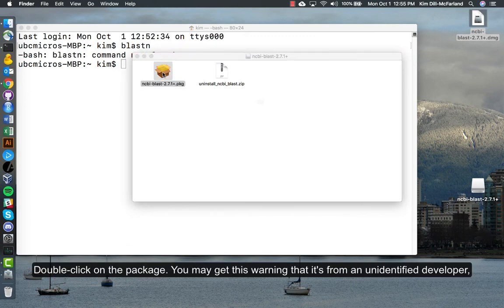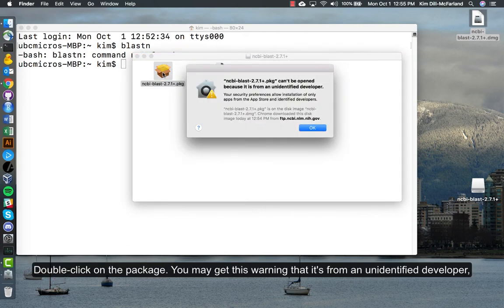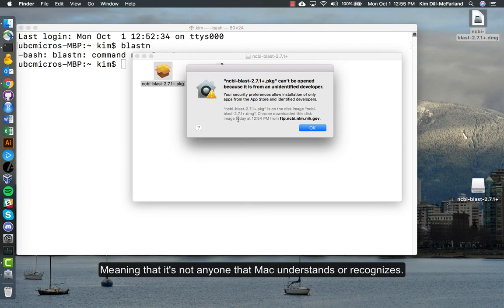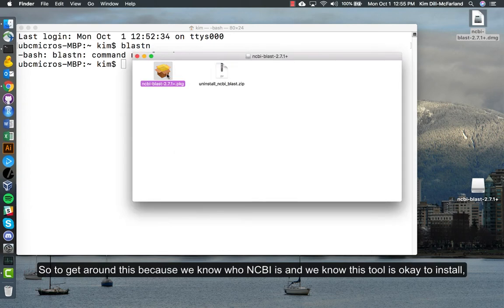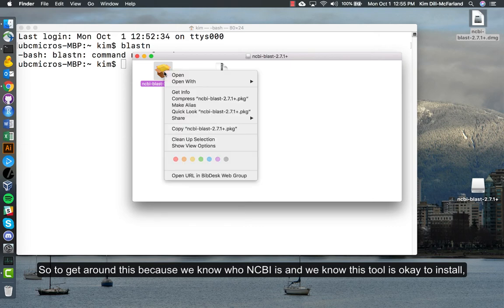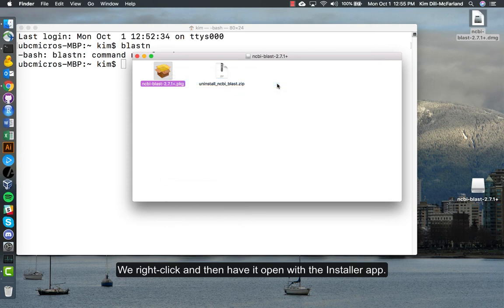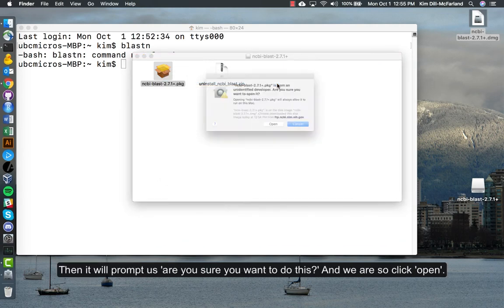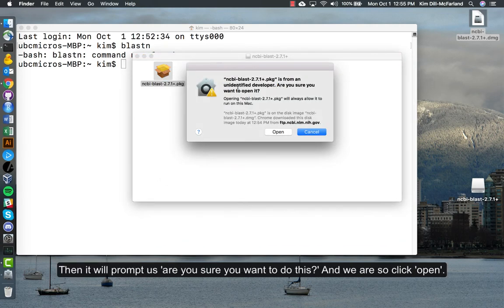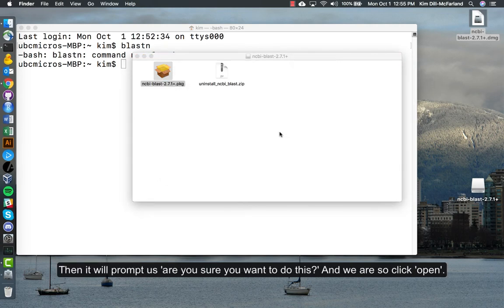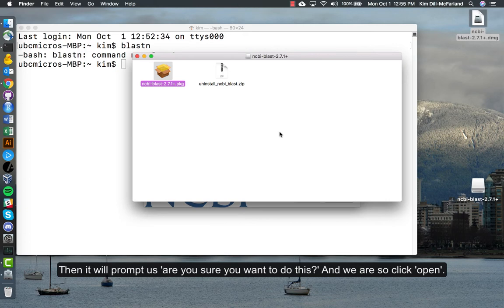If you double click on the package, you may get this warning that it's from an unidentified developer, meaning that it's not anyone that Mac understands or recognizes. To get around this, because we know who NCBI is and we know this tool is okay to install, if we right click and then have it open with the installer app, then it will prompt us: are you sure you want to do this? And we are, so we click open.